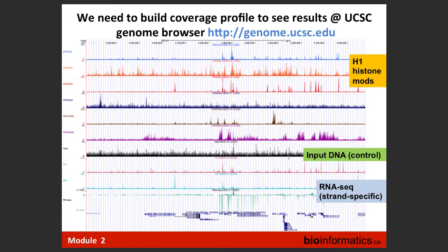Even if the absolute number is 160, and imagine this other library, where I don't see the number here, but let's say it's basic. Still, I see a clear distinction between peak and background, between foreground and background. It's okay. If my IP library looks like that, and this is the input, it has some kind of peaks, but it's very dirty, then I'm failing.